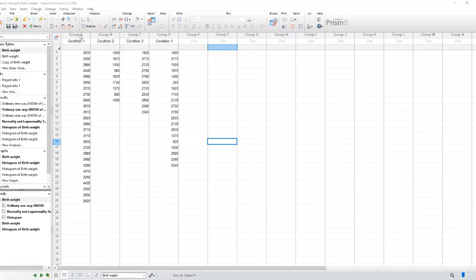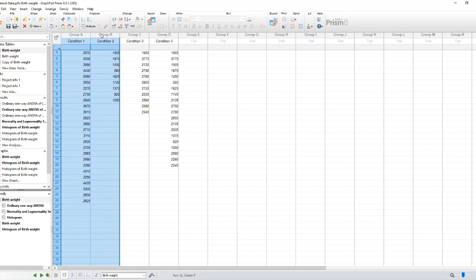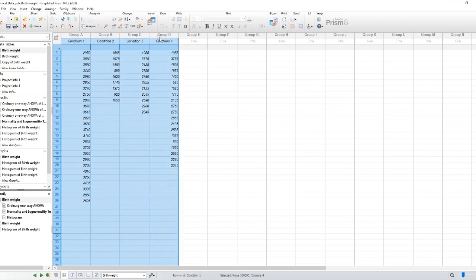Step 1. Select the dataset you want to analyze for normality. This could be a single column of data or multiple columns if you have different groups or conditions.